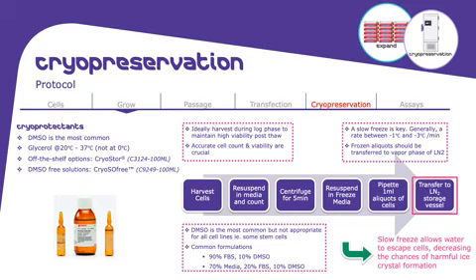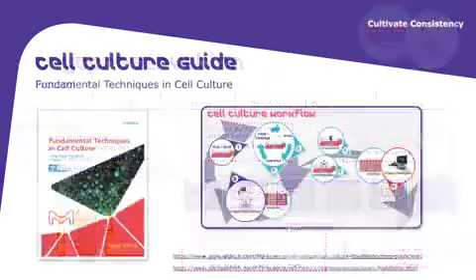Once the cells are frozen, they can be transferred into liquid nitrogen, into the vapor phase of liquid nitrogen, and kept there for a very long time. Please do keep all your records in order so people after you will be able to use those cells. Make a proper marking so they can also find what type of cells is frozen.